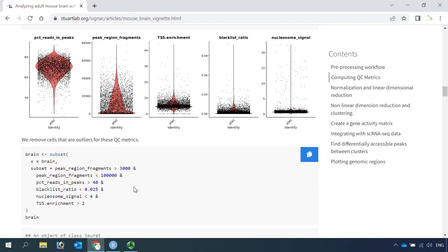In my video tutorials 1 to 3, I showed you how to analyze the PBMC dataset. The processes of analyzing the mouse brain dataset are the same as the PBMC dataset. So for today's demonstration, we just need to read the mouse brain Seurat object into R and then start to perform the motif analysis.